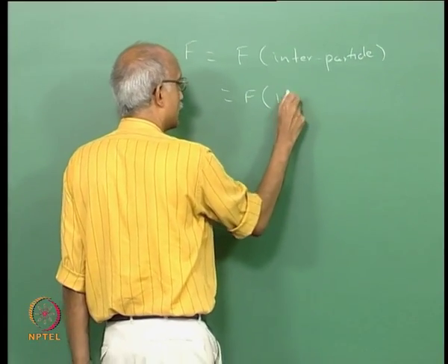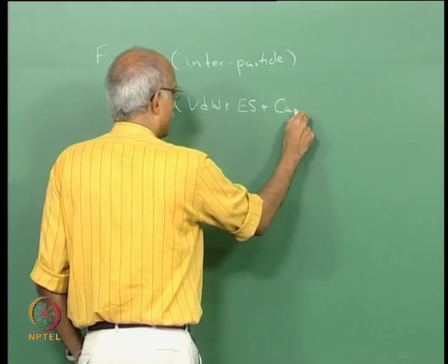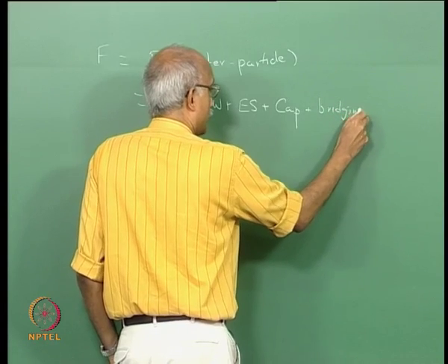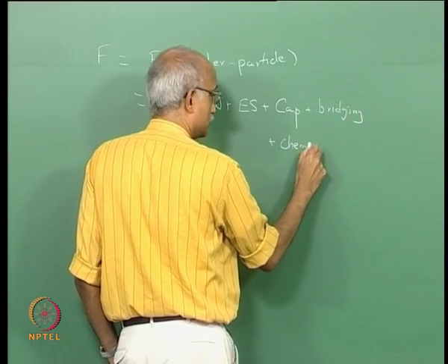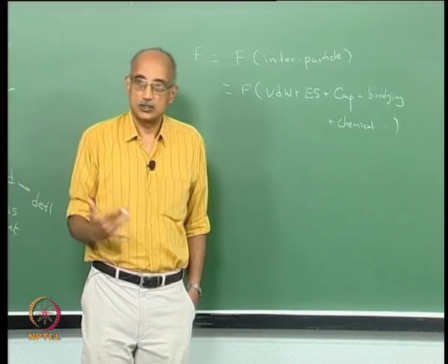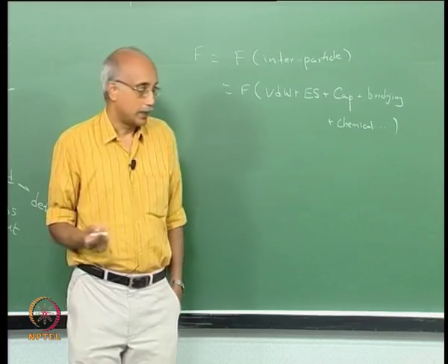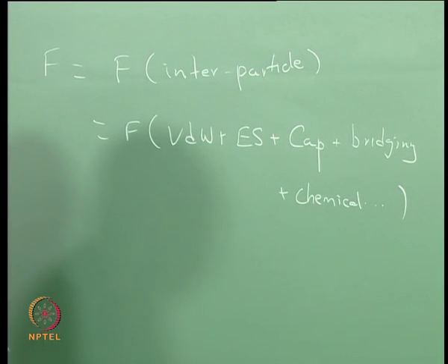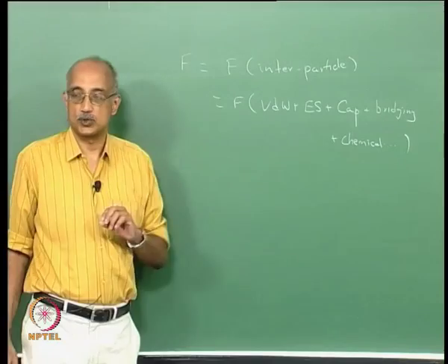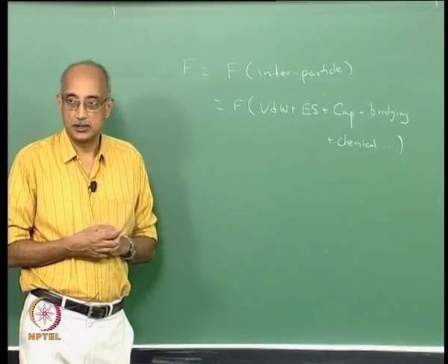So, this is a combination of the van der Waals forces plus electrostatic forces plus capillary forces plus bridging forces plus chemical forces and so on. I mean, it's a net force. If you recall our lecture on particle adhesion to surfaces, there are many contributors to particle to surface adhesion, and this technique, atomic force microscope, does not distinguish between the various contributions to the total adhesion force, but characterizes the net or sum of all the adhesion forces.